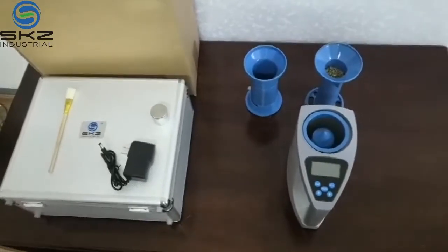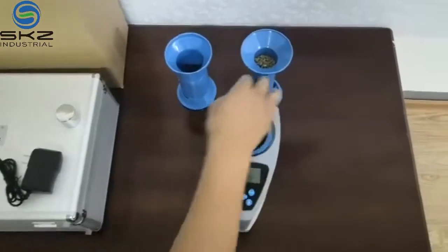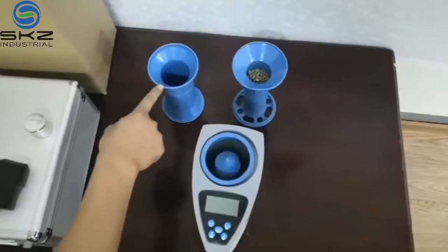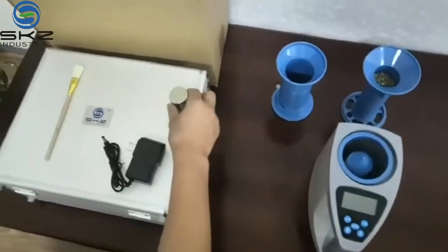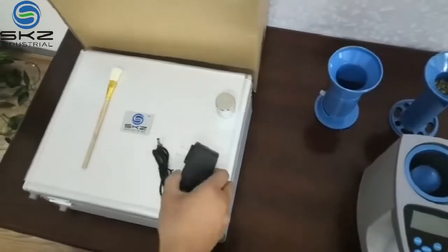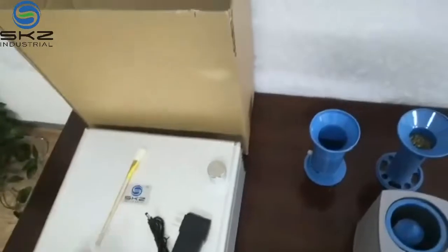Now let me introduce the accessories. This is the moisture meter. This is the funnel with scraping. This is the drop barrel. This is the saturation weight. This is the AC charger. This is the brush. This is the package with the housing and packaging.